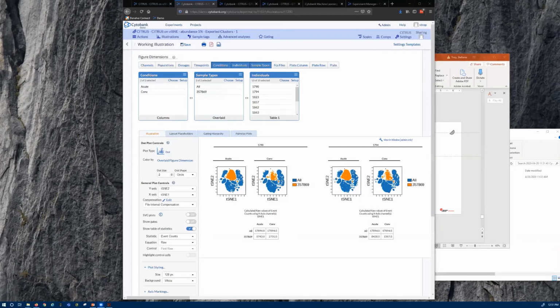Thank you very much. Okay, we have a question that's more specific, so we're going to try to tackle that one. Laura says, I've tried to use the LASSO model to predict which samples belong to certain patient groups. I had 2 groups in total. A number of clusters were identified as being significantly different. However, when I inspected the cluster abundance box plots, they didn't visually appear to be different. Do you know why this might be the case?